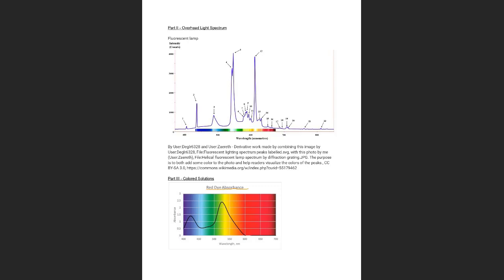It has 2 peaks, right? You pick the first peak and you will identify the wavelength of the first peak. For me, I wrote 424. This is in nanometers. Then they ask you what is the wavelength of the second peak. So you do the same for the second peak and write the wavelength.